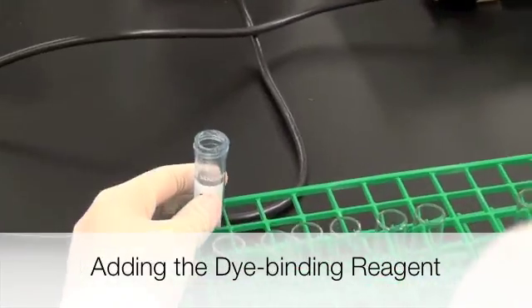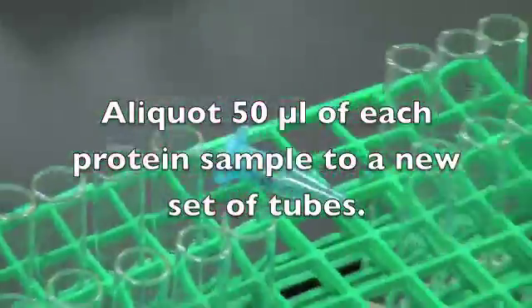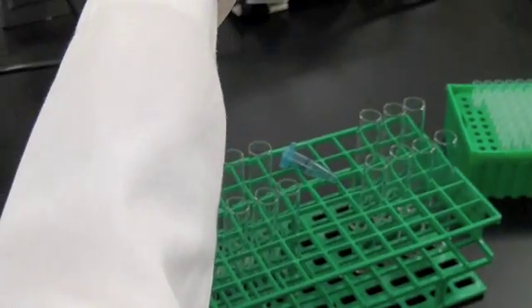Once all the dilutions of the standards and unknown are made, you are ready to add Coomassie dye to uniform volume aliquots of the standards and unknown.